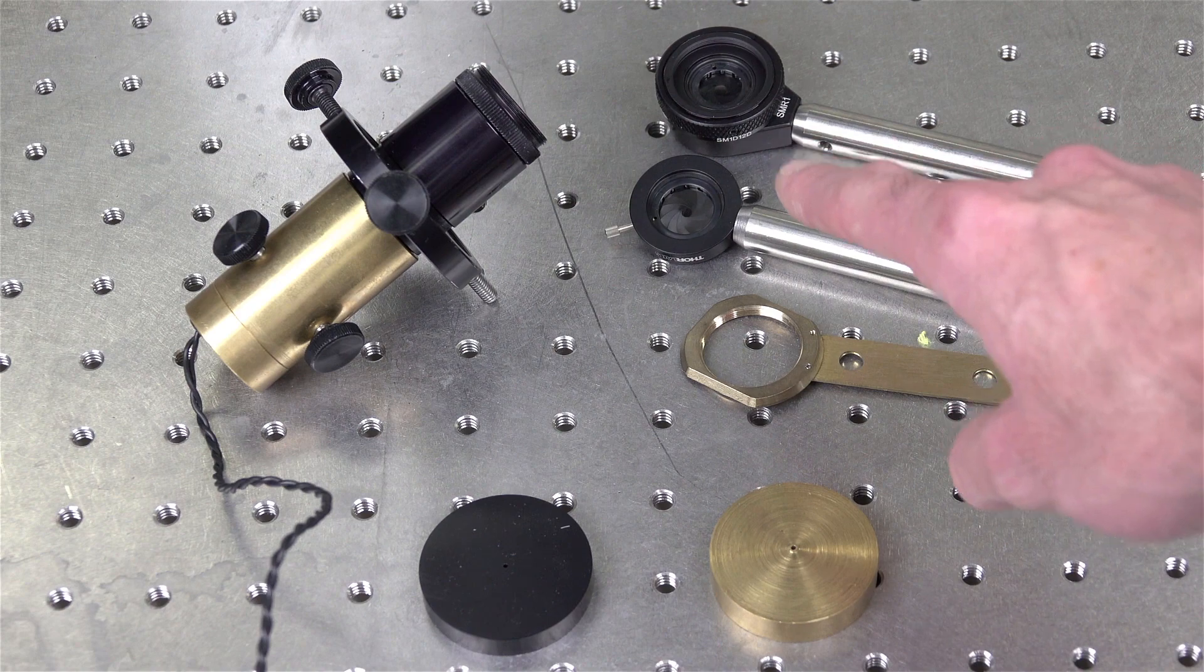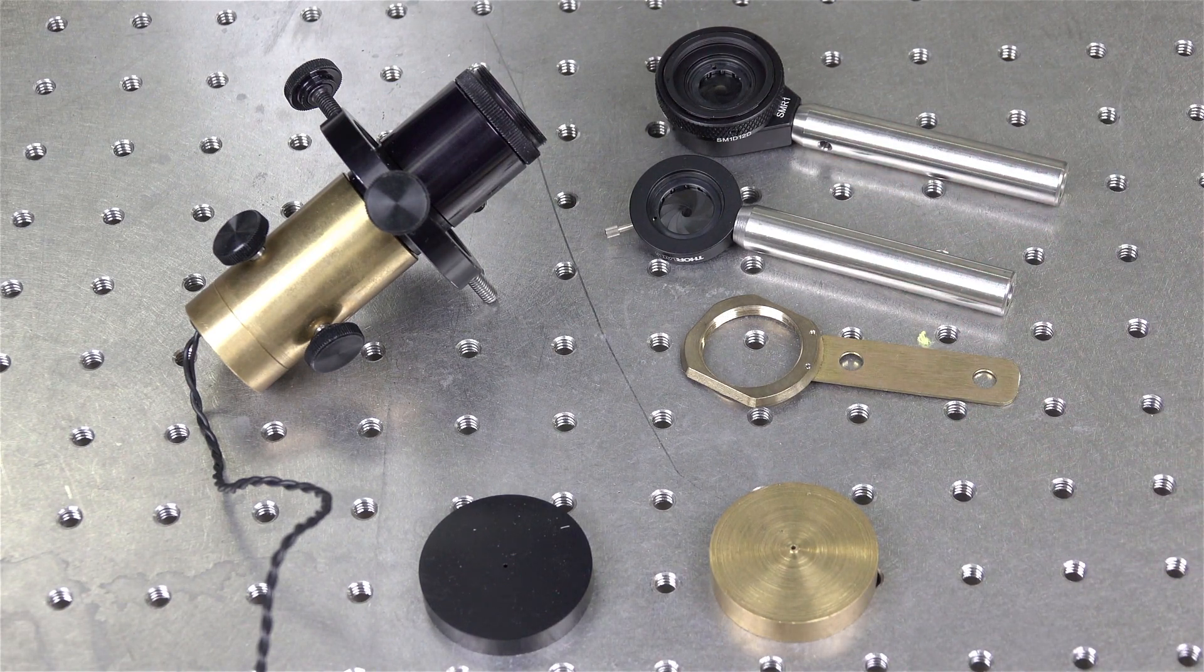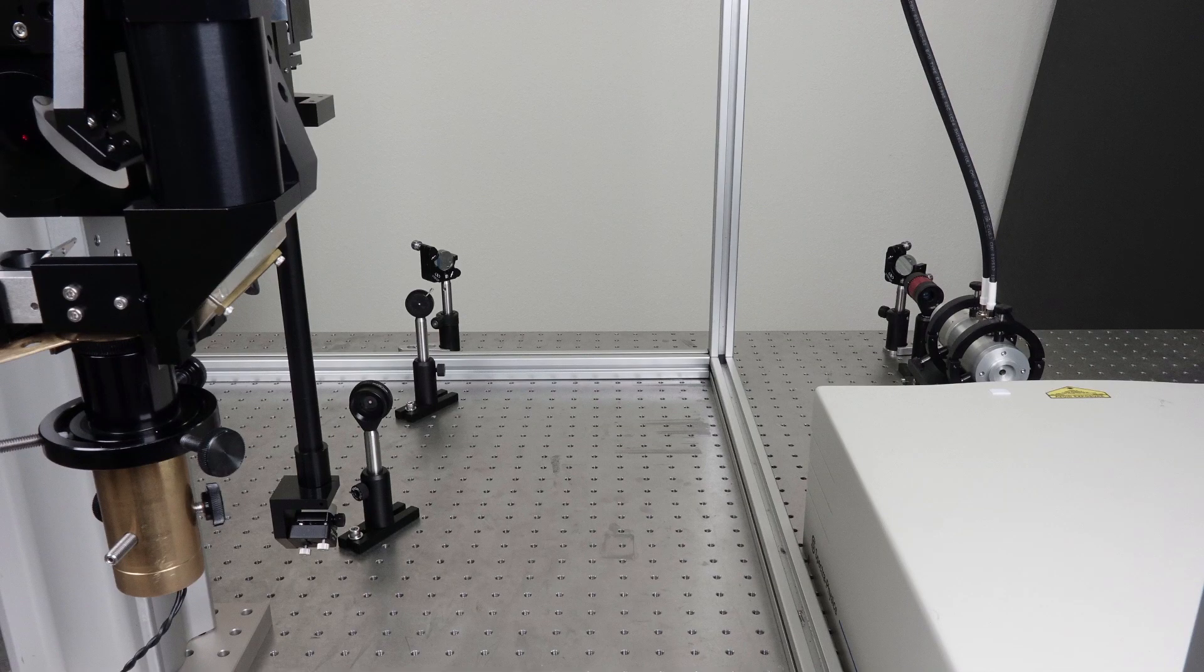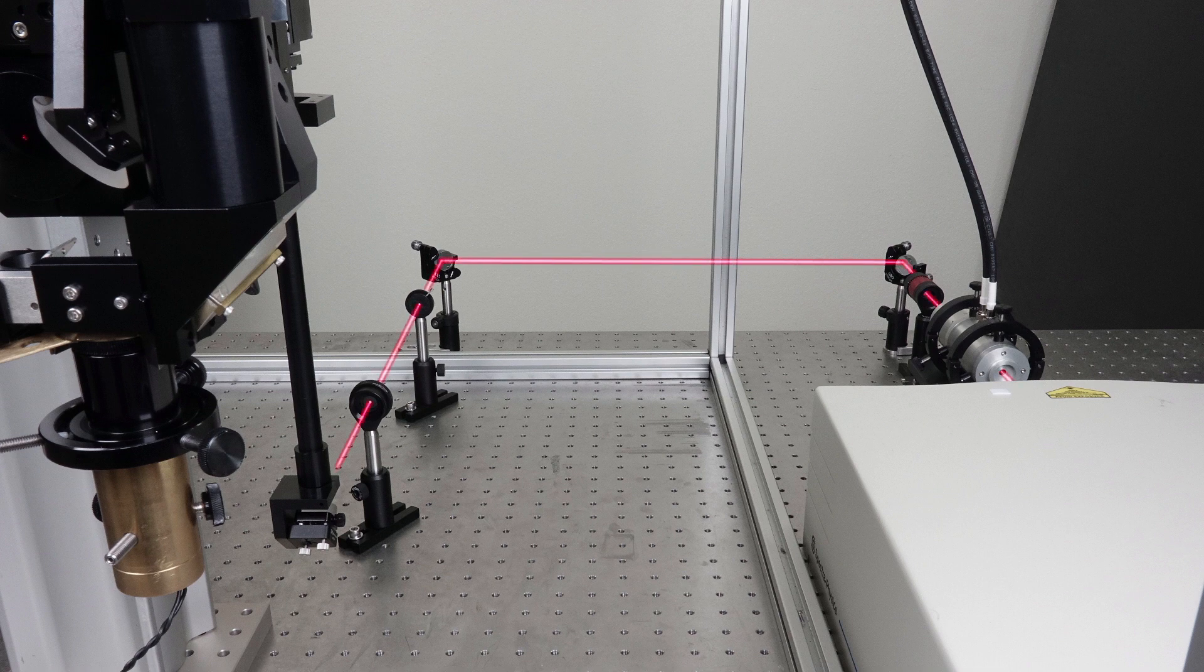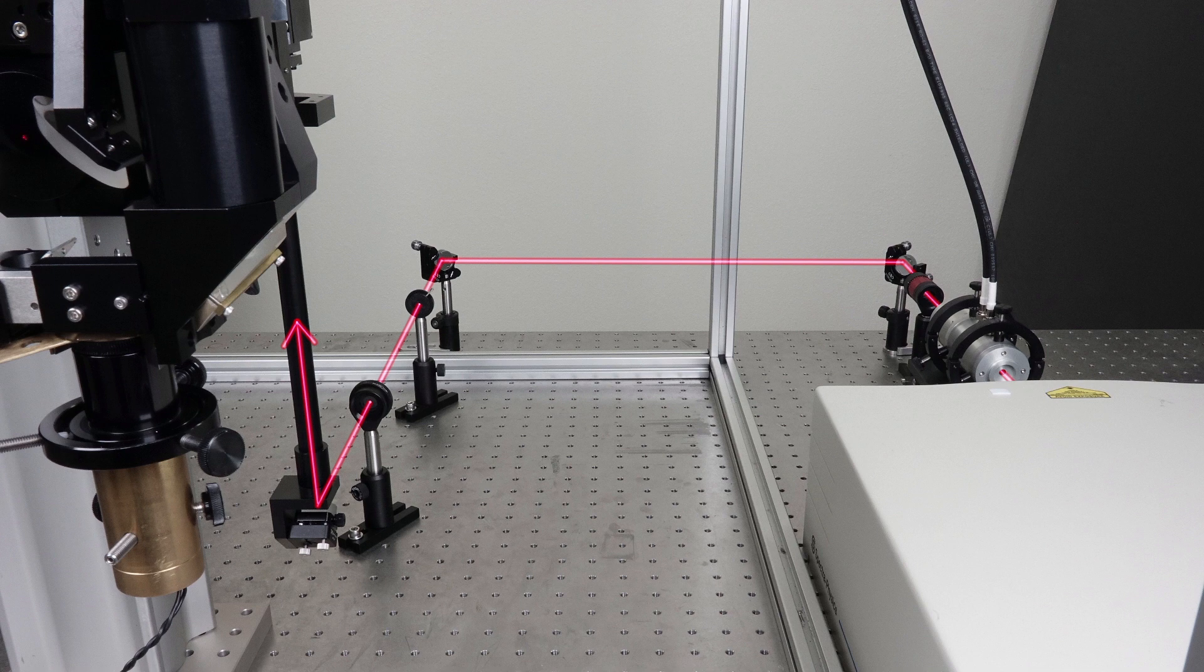We can then set up pinholes on the table using the centered alignment beam. Then, as a final step, we will run the imaging laser through the table pinholes and into the system. With a final tweak for centering the beam, the system will be ready and optimized for imaging.